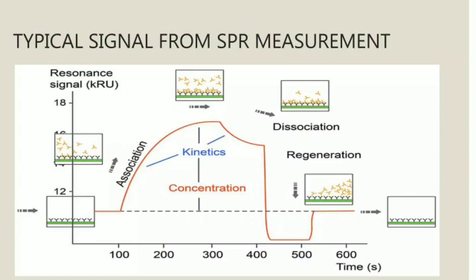This is a picture of a sensorgram. The angle at which the dip is observed versus time is plotted. First, no change occurs at the sensor and a baseline is measured with the dip at the SPR angle. After the injection of the sample, biomolecules will adsorb on the surface, resulting in a change in refractive index and a shift of the SPR angle. This adsorption-desorption process can be followed in real time and the amount of adsorbed species can be determined.